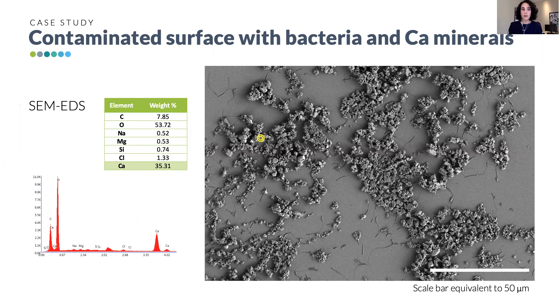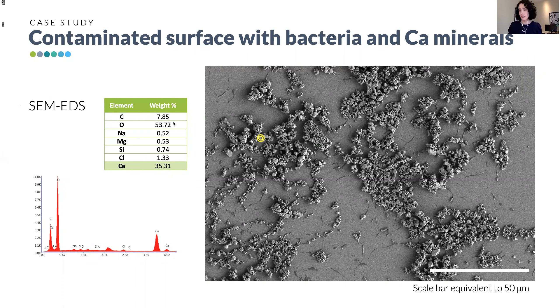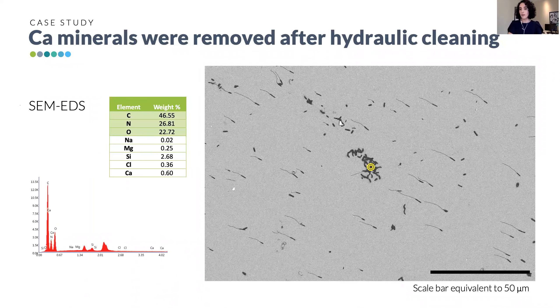After contamination with produced water, we found elongated shapes on the surface — identified as bacteria — and solids on top of them which we identified as calcium carbonates, based on high calcium, carbon, and oxygen content from SEM-EDS analysis. After hydraulic cleaning, most solids were removed, and what remained was primarily bacteria — identified by shape and composition showing high carbon, nitrogen, and oxygen levels.